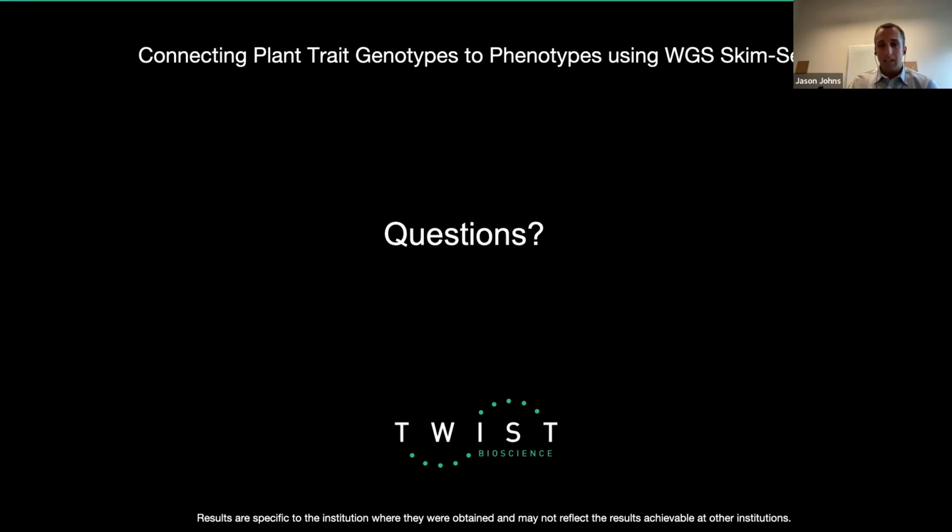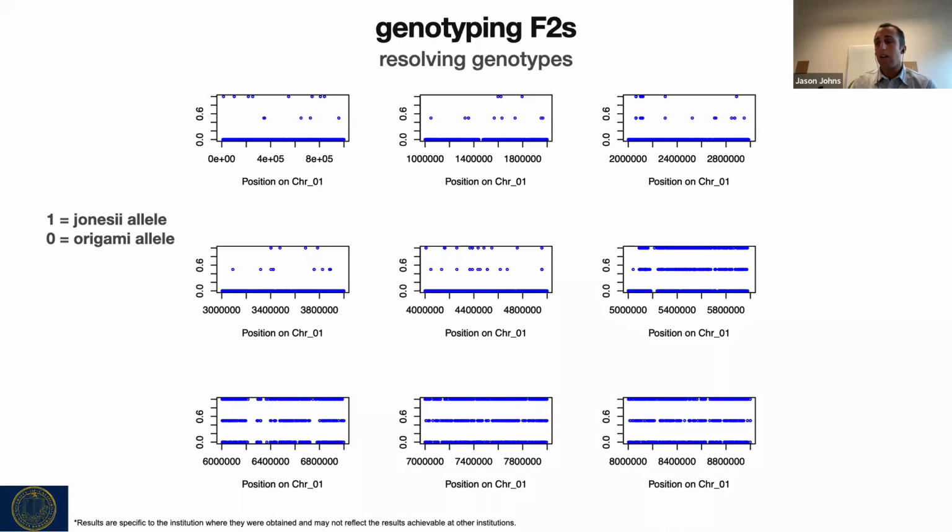And actually, I can pull this slide up too. So if you know the recombination rate for your taxon, then you can decide based on that and make it so that your bins will certainly capture that recombination rate.